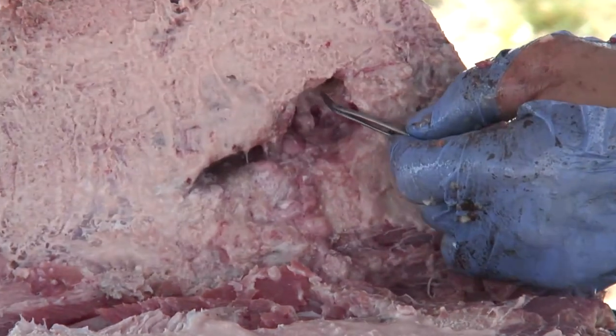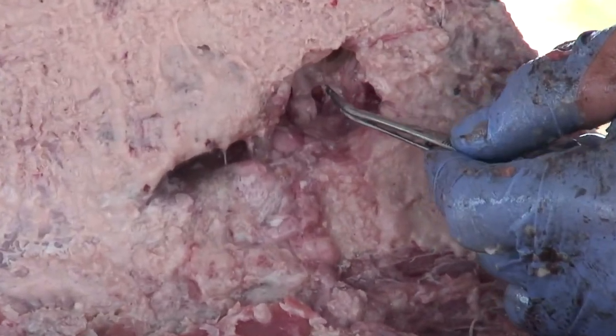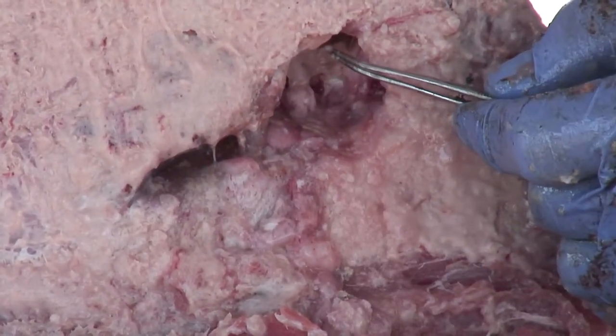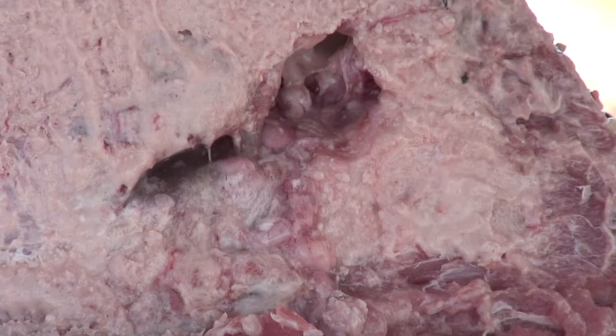Take the forceps, grab the edge of the membrane, just twist it around a little bit like that — nice and easy — and out they come.